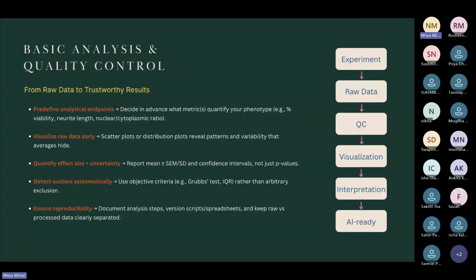And so here I want to say that basic QC just means looking at your raw points, looking for patterns, but also looking for noise. In most cases, if your treatment effect disappears when you show error bars, you don't really have a story yet. You need to revisit everything that you are doing and see what happened there.